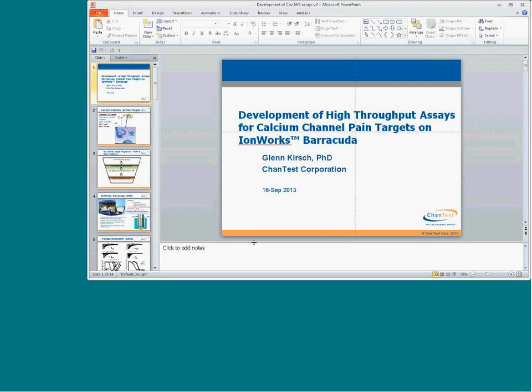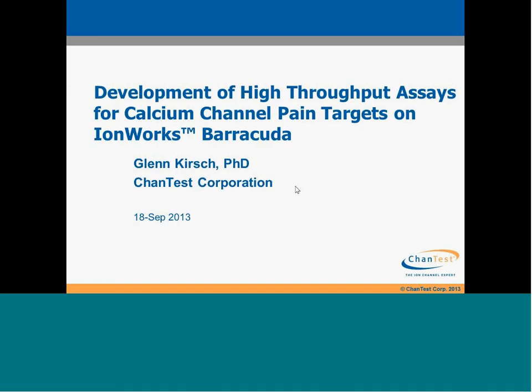Very good. Well, thanks, Jim, for the opportunity to present some of our recent work. Chantest, as most people probably already know, is a contract research organization, and we have a focus on ion channels to provide drug discovery and drug safety services for a variety of customers. Today I'm going to talk specifically about some of the work we've been doing to develop and validate voltage-gated calcium channel assays on the IonWorks Barracuda.